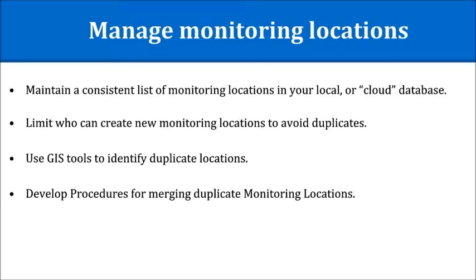And then develop procedures for merging duplicative monitoring locations, because most people will find that when they start parsing through their data, there is a lot of data. There are a few monitoring locations that may be actually very similar, and having a protocol to deal with those, and whether or not you establish a new station.